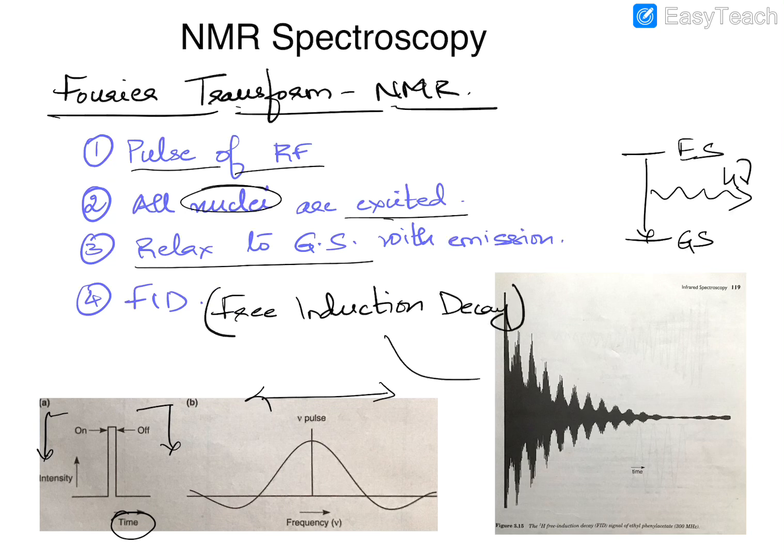And this free induction decay looks somewhat like this. If at all you look at an FID file of a certain NMR that is recorded in the FT NMR. Now, what the FT NMR does is that it separates each one of the waves which have interfered together to give this pattern from the different types of nuclei that are present in the sample.